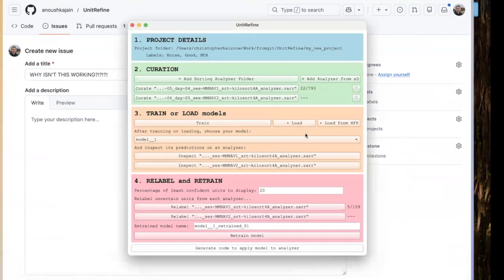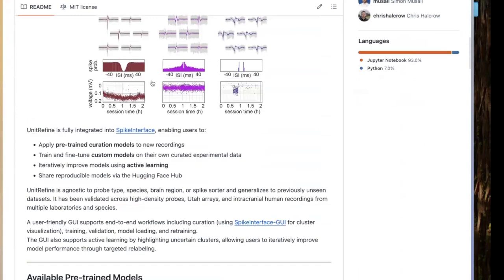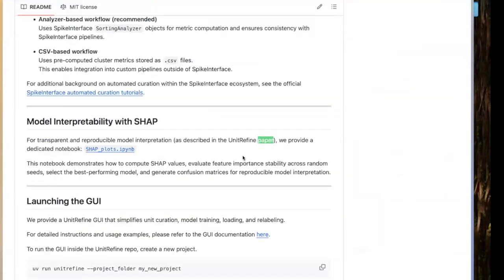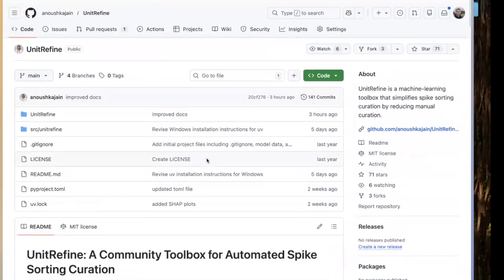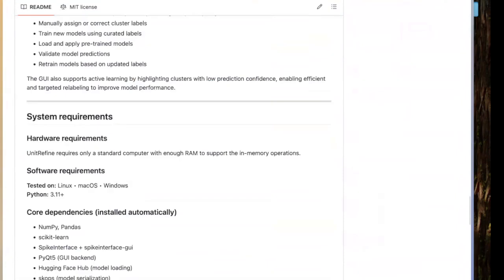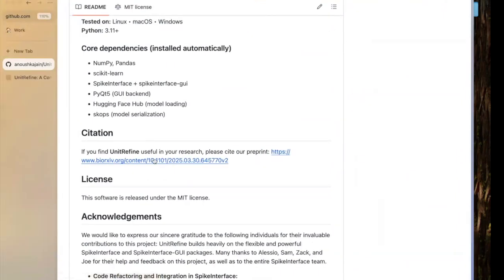And if you have questions about how many units you have to label and these kind of decisions, some of these answers are in the documentation, and they're also answered in the paper, but if you still have questions, do use the issues. We will help you. We need to mention the paper earlier in the repository, and I think I did. No, there is. Okay, it's here. Great.